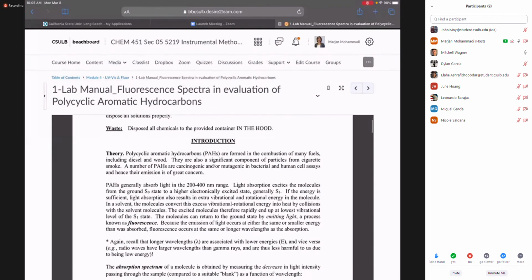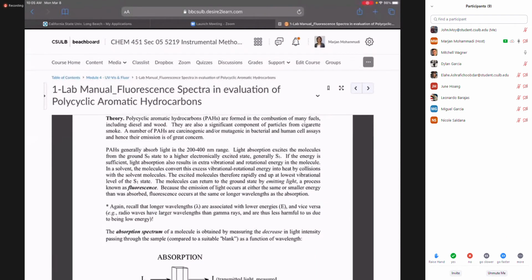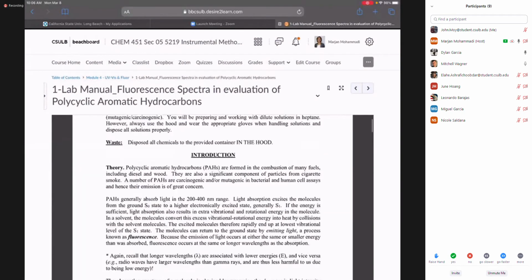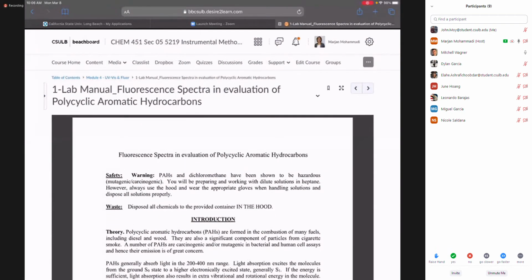So you are going to do the benzoanthracene, chrysene, what is the other one? I can't remember. It's part of the procedure. Exactly. So guys, 4 of them, for all of them, and you have data. Is that clear right now? Correct. That's correct. Shall we continue? Yes. Good.